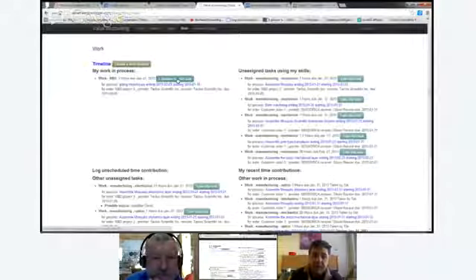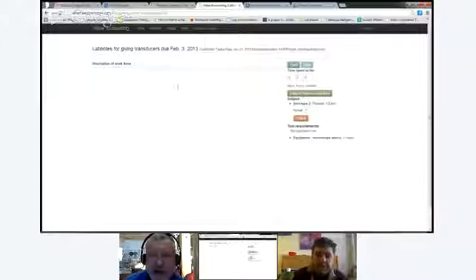So when is the time contribution going into the value accounting system? Is it when you take and commit to the task, or from the lab note? Your time contribution comes from the lab notes page. That's where you say how much time. So now you got your time spent so far. Let's say you start working on it today. You can do start and stop, or you can just enter the days, hours, and minutes that you worked on that.